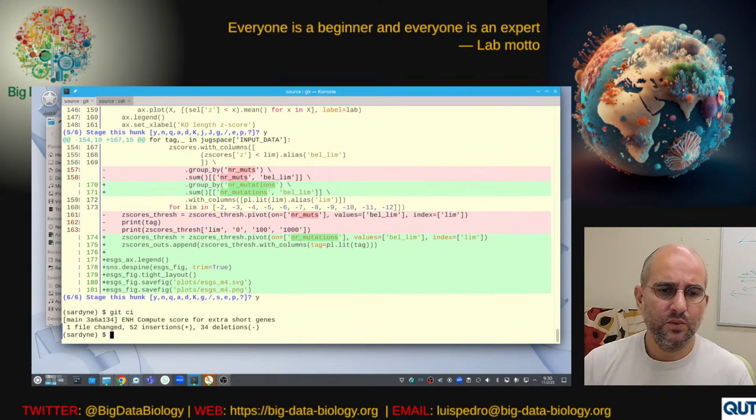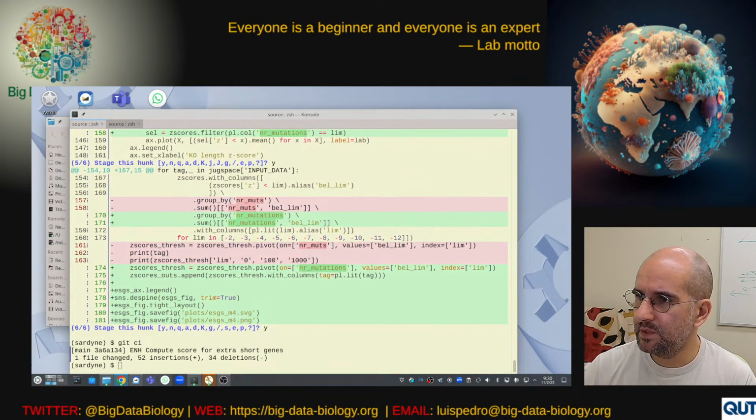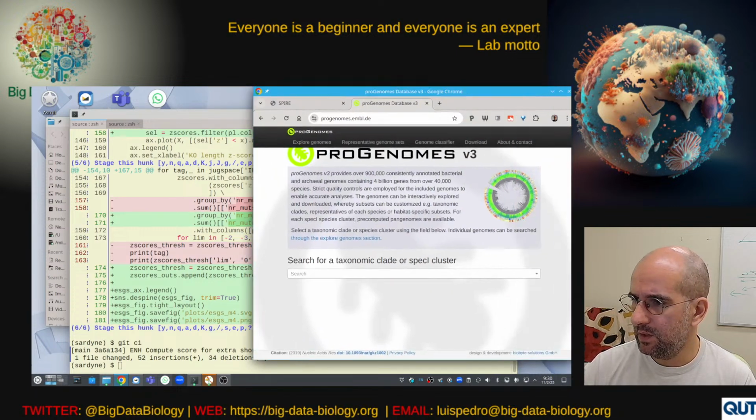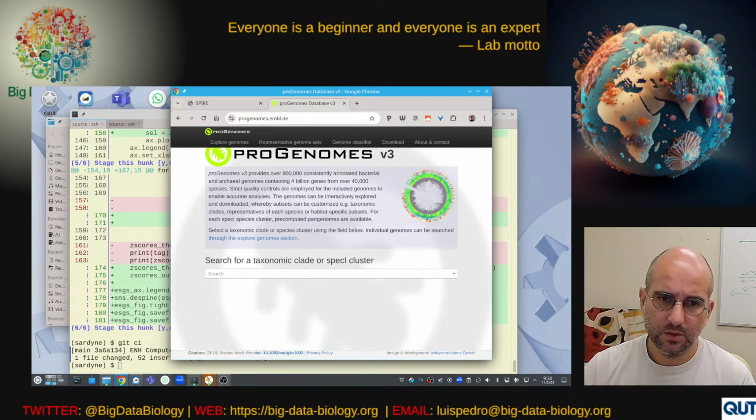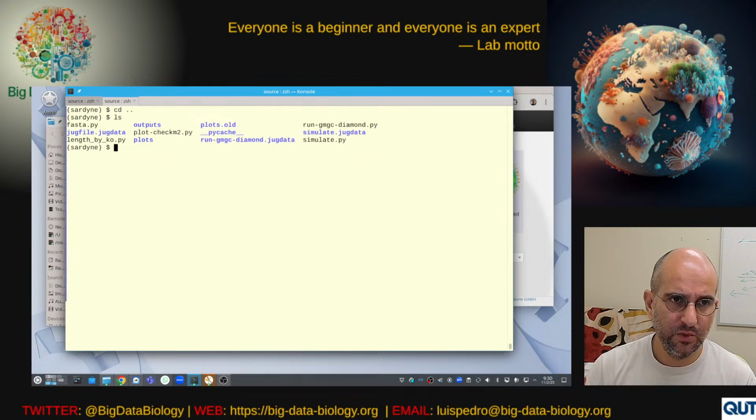Okay, so this wraps up last week's session with a bit of a cleanup. And now what I promised today is that we would look at a few more genomes. And actually I wanted to do two things. I did pre-prepare a little bit. So far we've been looking at, let me go here.